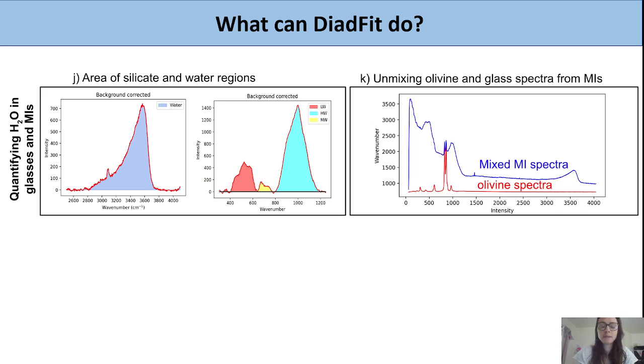There has been increased interest in using Raman spectroscopy to quantify water content in silicate glasses. For a spectra collected, you can quantify the area of the silicate region and the area of the water region and take the ratios between these.